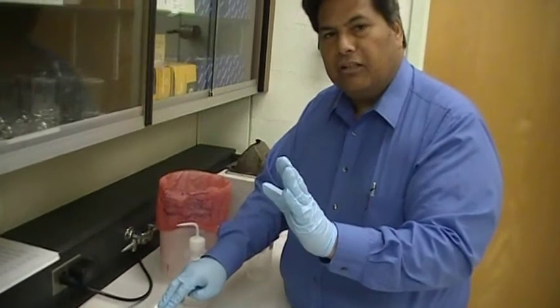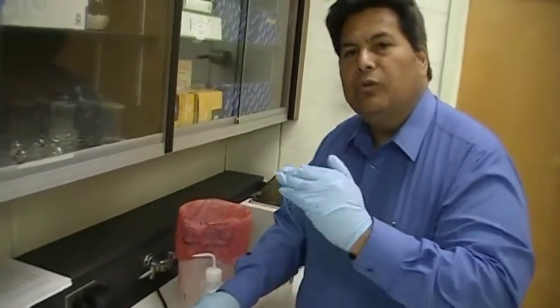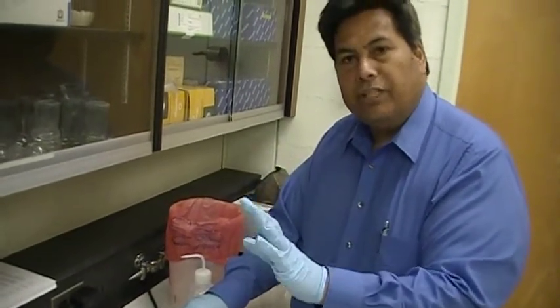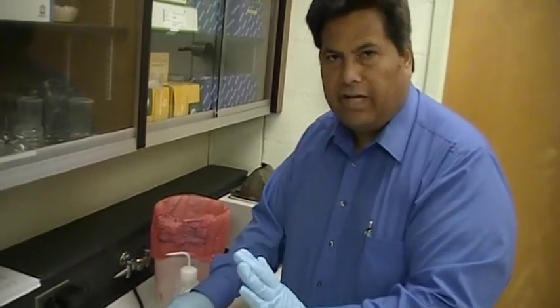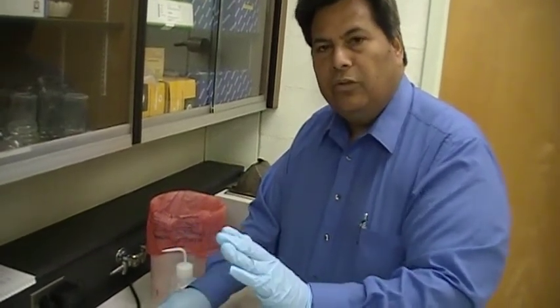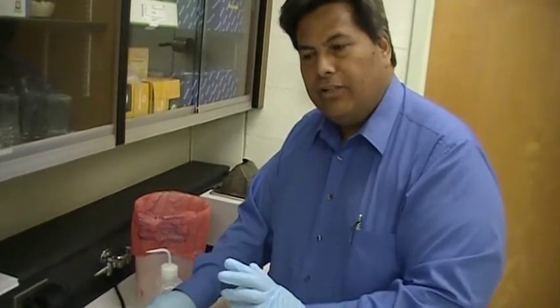But, please don't forget the dilution factor. Dilution factor is how many times you have diluted your sample and you take that into consideration also. Let's say, for instance, that I took 10 microliters of DNA and mixed it with 990 microliters of sterile deionized water. I have taken 10 microliters of DNA and diluted it to a total of 1,000 microliters. If you are to take 1,000 divided by 10, that is equal to 100. So, my dilution factor is 100.